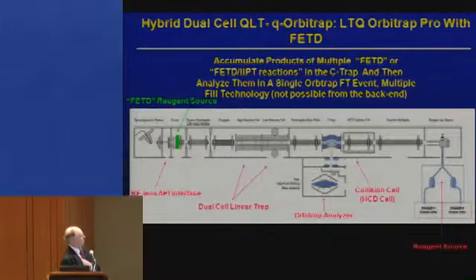In this case, we don't average anything. If we want 10 times more ions, we just do this experiment 10 times and park them all down here one after the other and then finally analyze them. So right off the bat, you gain a factor of more than 50 or 100 in sensitivity.